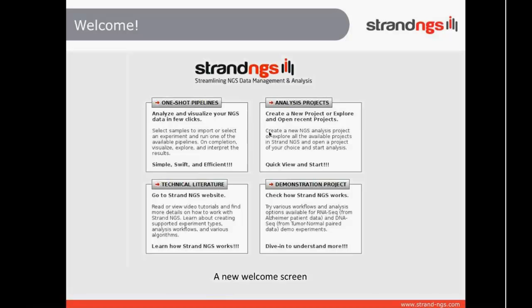The very first thing you see when you boot up Strand NGS, and those of you who are using Strand NGS for the first time may not notice this, but people who've been using it for a while will see that we've changed our welcome screen. This is what you see when you start Strand NGS, both for the first time as well as every subsequent time.